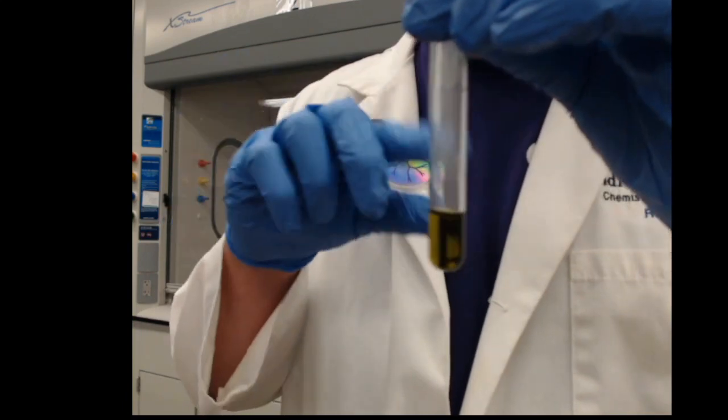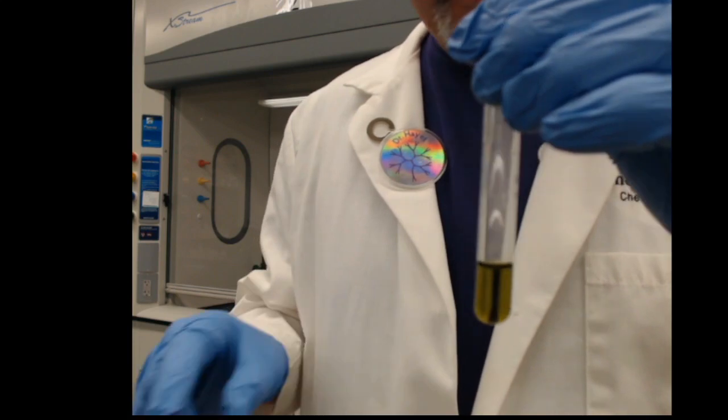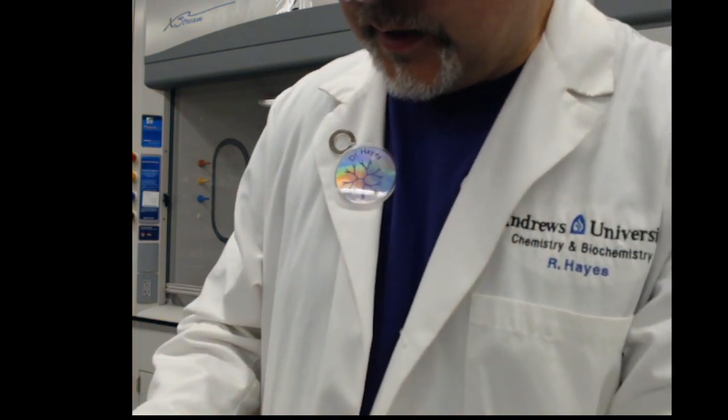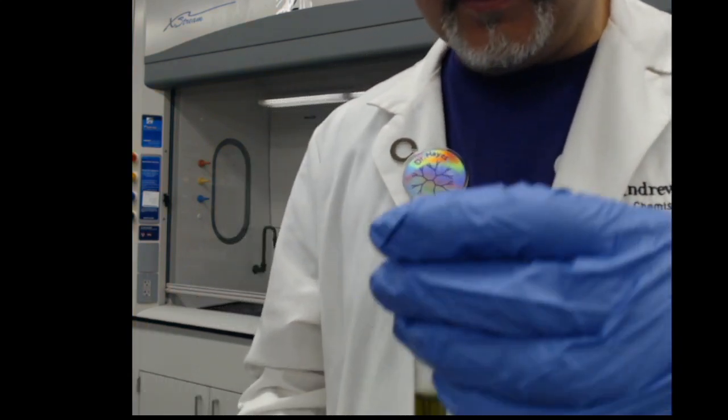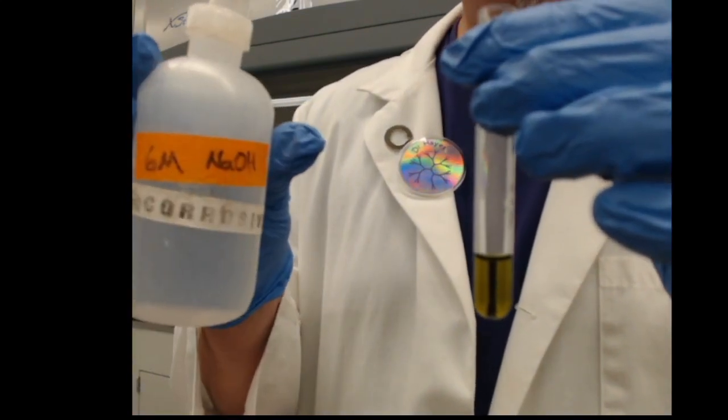So yellow and purple are the two colors here. So that original one was the purple with the water, the violet with the water. Now I'm going to add six molar sodium hydroxide.